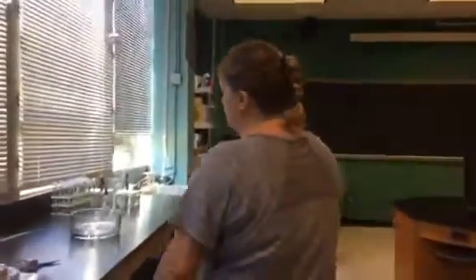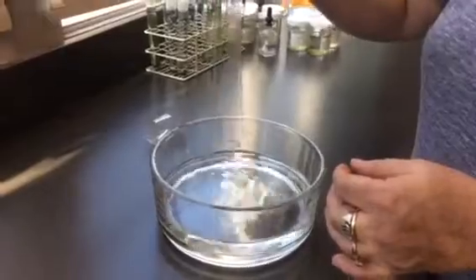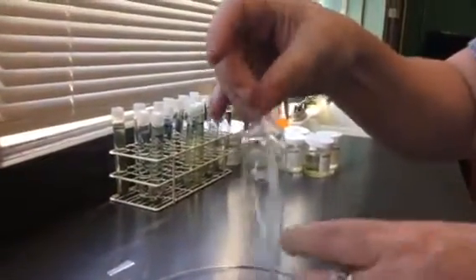Once you've mixed your solution, you're going to put it into dialysis tubing and make your mock cell. We've already talked about that. This is what dialysis tubing looks like. It kind of looks like paper. Your instructor will already have put it into water, so it looks like this. And what you have to do when you get it is rub your fingers together like this, and as you do, you can see that it opens up.